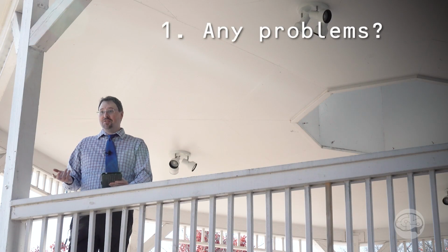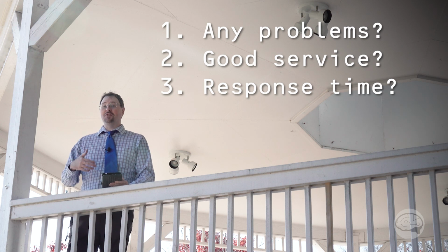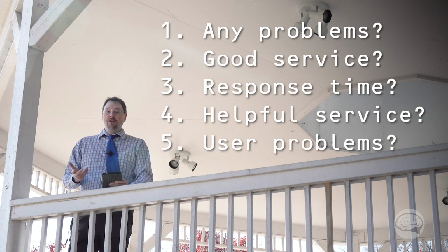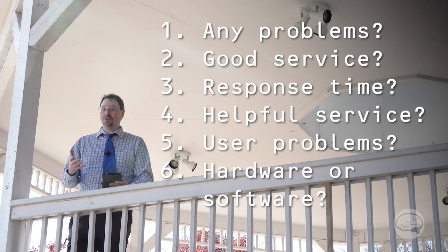So the kinds of questions you'll want to ask are fairly obvious. Have there been any problems with the microscope? And if so, what? How has the manufacturer's service staff been? How long does it take for the service to respond and then show up to your site? Are the service staff helpful? Have your users had any problems with using the instrument? Are those problems hardware or software related?